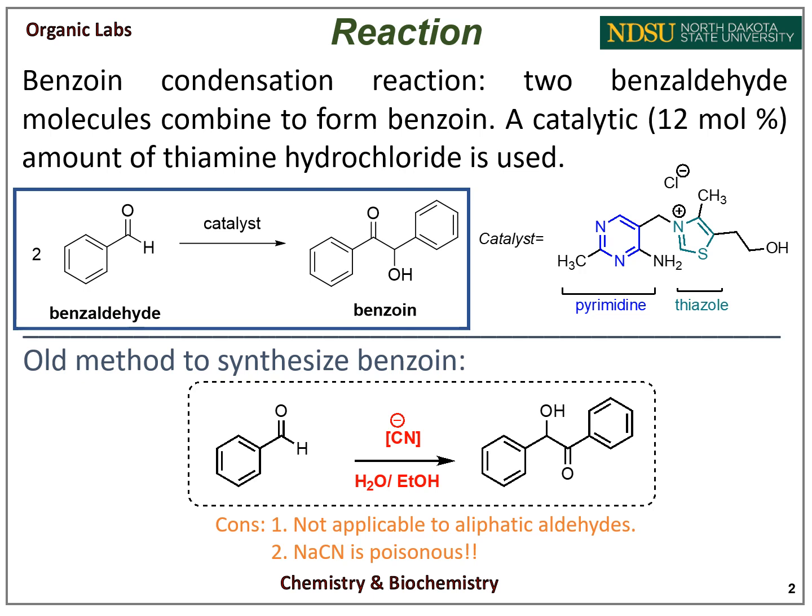The reaction we will be doing today is a benzoin condensation reaction. This is a reaction of two aromatic aldehydes, in our case two benzaldehydes, in the presence of a heterocyclic catalyst, thiamine hydrochloride, to form our benzoin product.